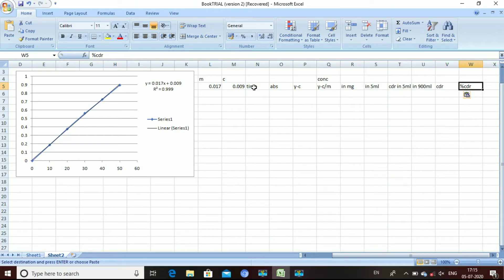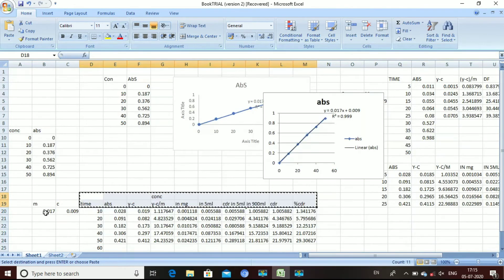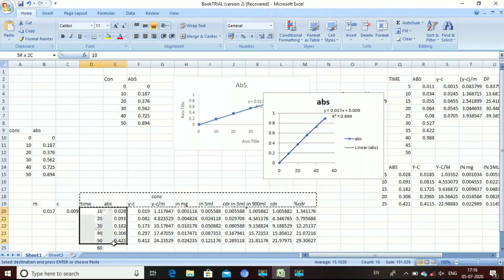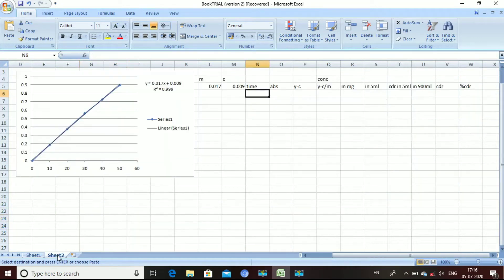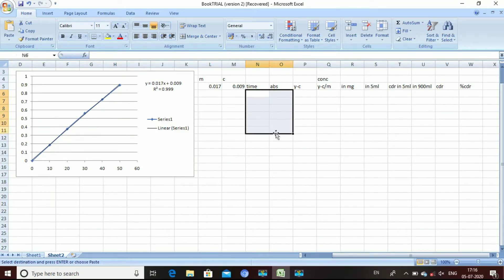The first column is time — the particular time intervals at which we analyze the sample. The next column is absorbance, which is the absorbance of the sample measured at each particular time interval. The third column is y minus c.